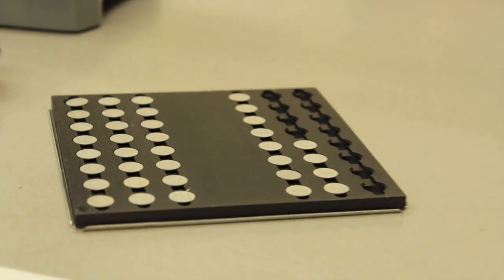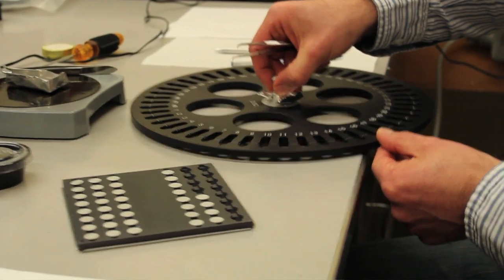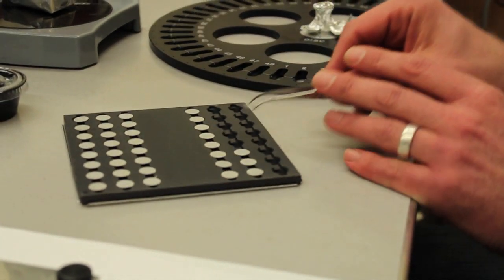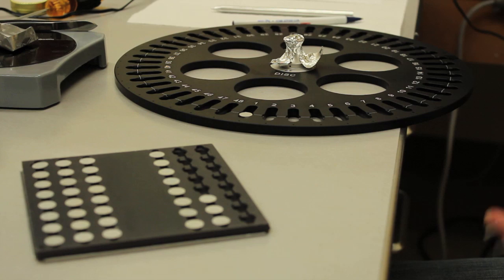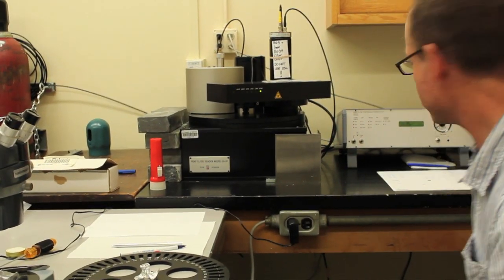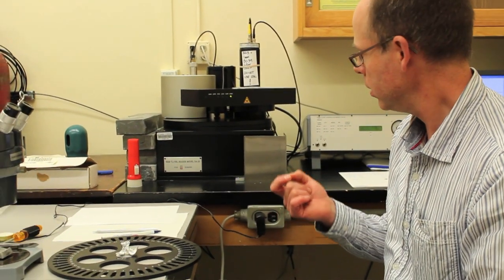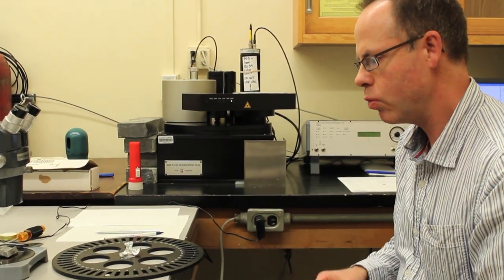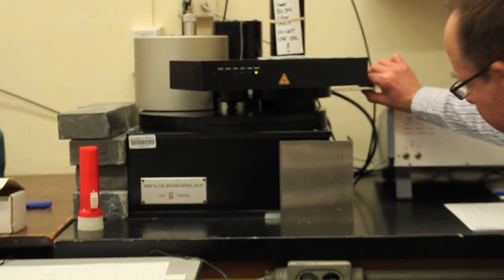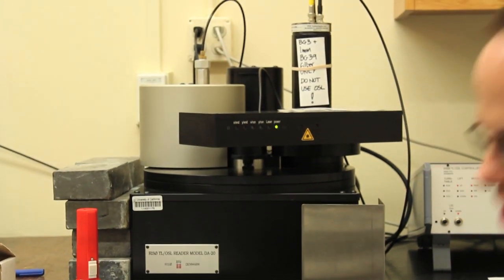The aluminium discs we place on a holder, such as this. So perhaps I'll just put one in position to illustrate the way that we would do that. So we take one of the samples, put it on the holder, and the holder goes inside this machine behind me. The whole thing there is controlled by this computer off to the side. And we can take this sample and then bombard it with light, and the light is in a series of light-emitting diodes mounted in this block on the right-hand side of the machinery.